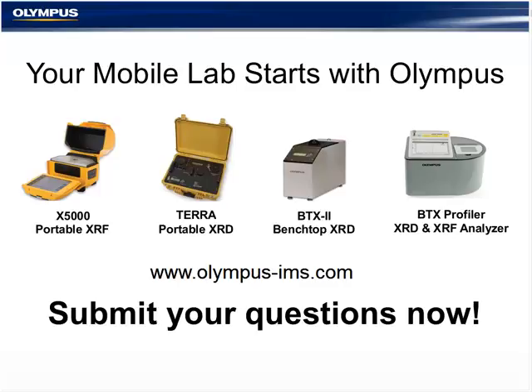Yes, we have another one coming in. How do we get standards to build calibration in XRF? Well, as a company, we're not a standards provider, certified reference materials. There is NIST, ASTM, USGS, just to mention a few. If you go to those websites, they have many, many standards that will suit your exact needs with certificates of analysis, everything that you need.